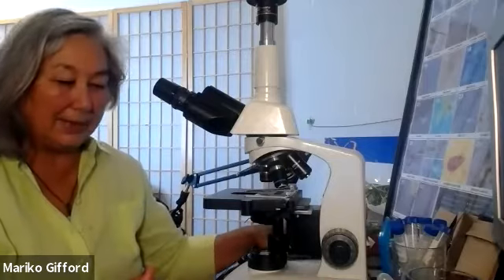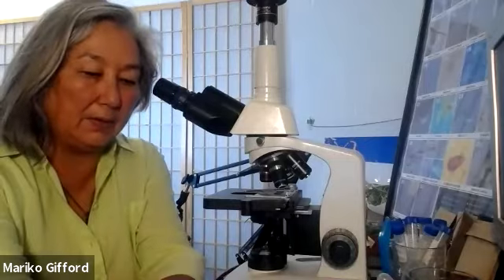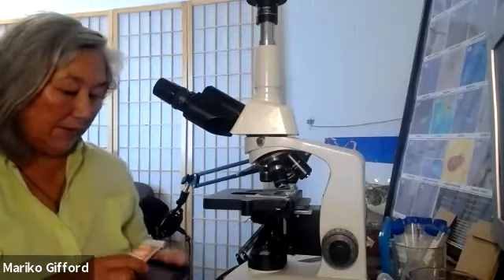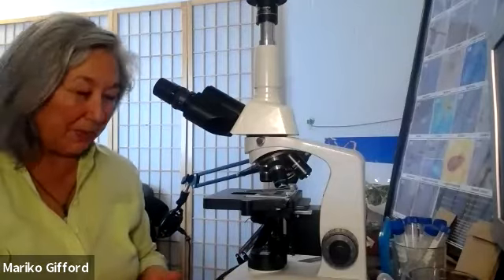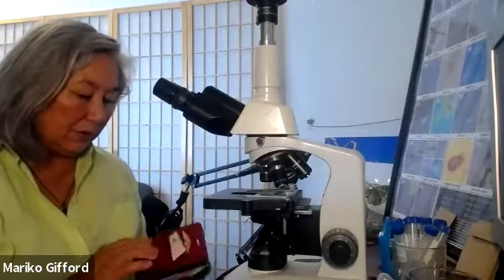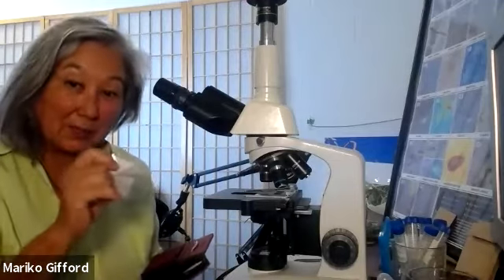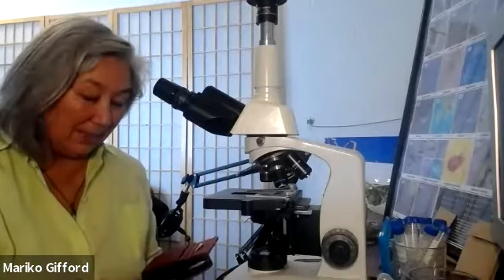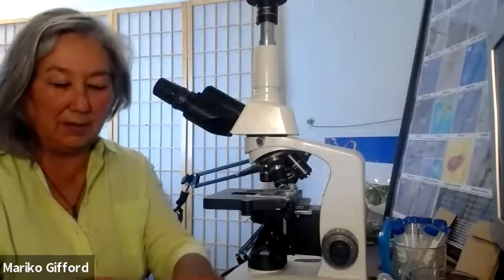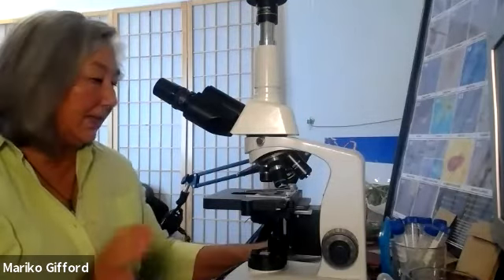And you can get them for less expensive than this. I just got one that I thought could have more magnification in case I needed it, but you don't need it for what we're doing with the soil biology. So just wanted to share that. It's quite amazing. Since you're on a farm, you want to make sure to take along the lens cleaner to make sure that your camera lens and the lens of this little microscope keep dust free, because otherwise you're just going to see a lot of disturbance in your slide from that. So quite an amazing thing.